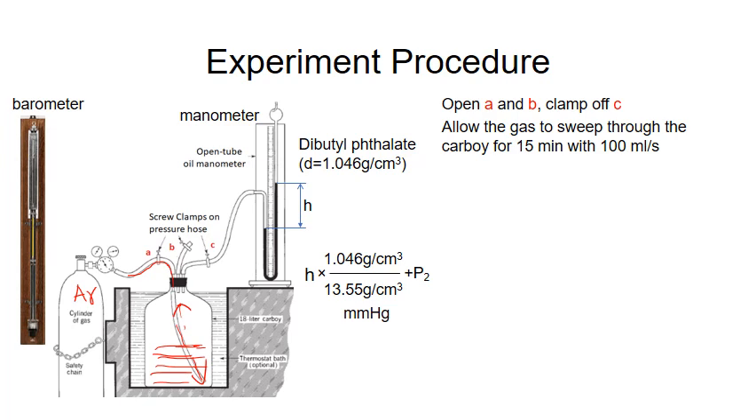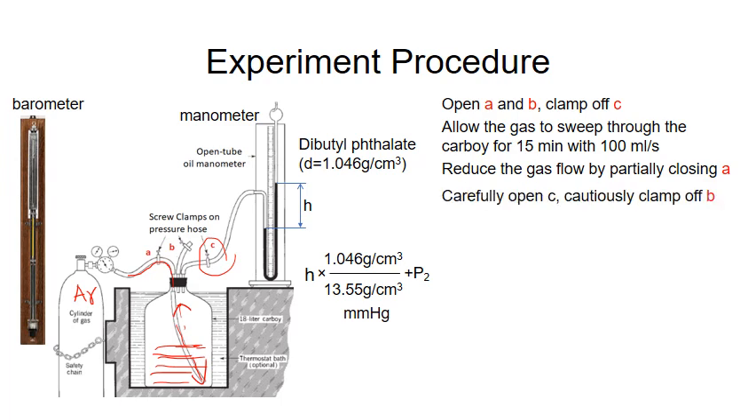In order to measure the pressure, we need to open clamp C, but we have to do it very carefully because if we do it too fast, the gas will blow away the liquid in the manometer. To do that, we need to partially close A to reduce the gas flow, then carefully open C so it is connected to the manometer, and then cautiously clamp off B. Because the system is still connected to the cylinder, the pressure will increase with time, and the height H will increase.